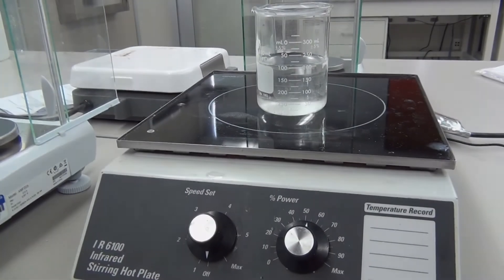For step two, you are going to clean all of your glassware and your workstation. For step three, go ahead and start boiling water in the glass beaker to use as your water bath.